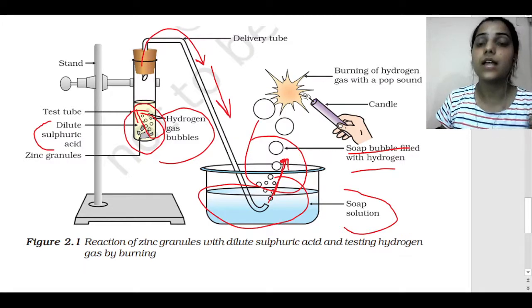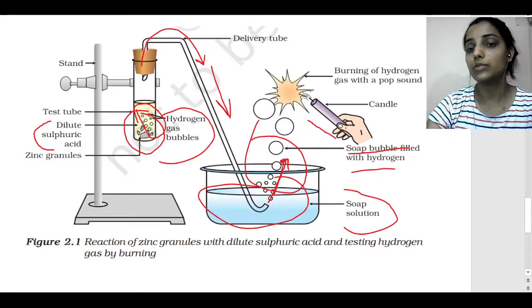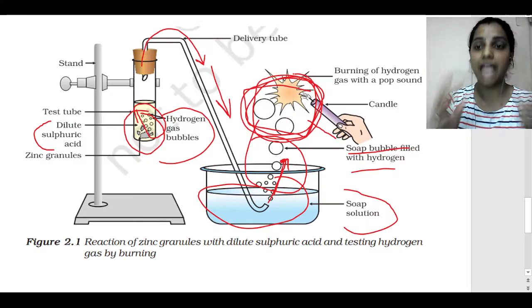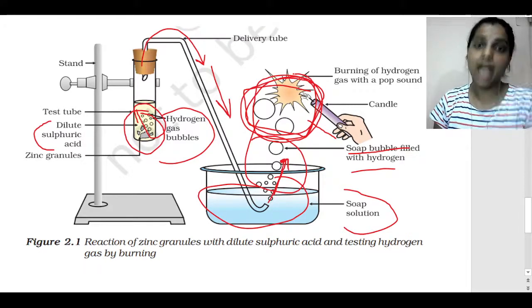So we will take a burning candle near the bubbles, and students, this is the result: the burning of hydrogen gas with a pop sound.